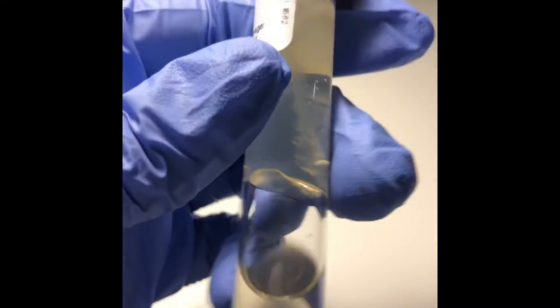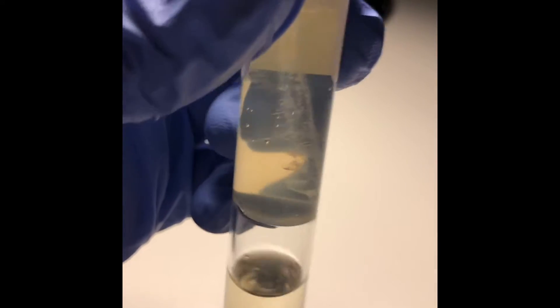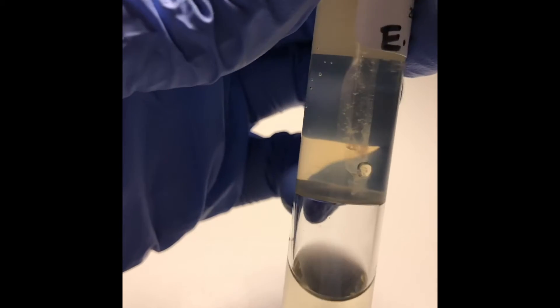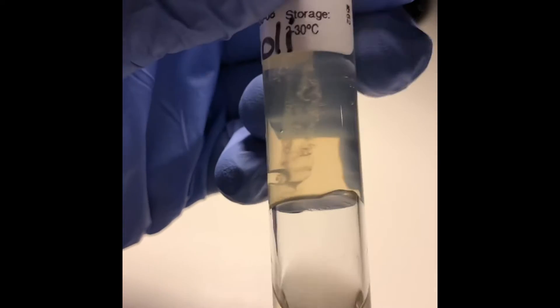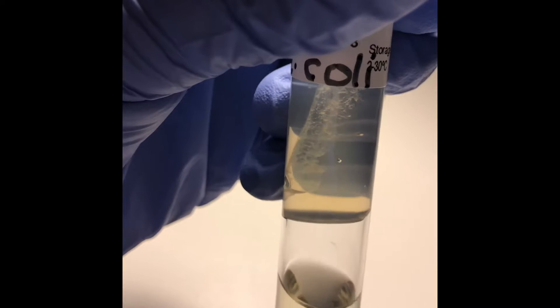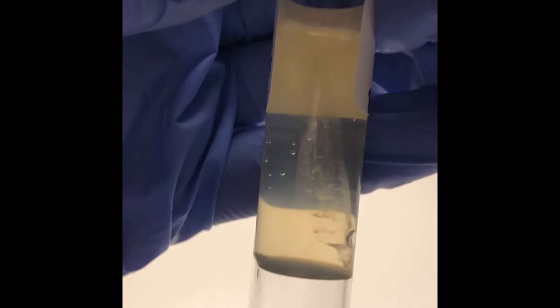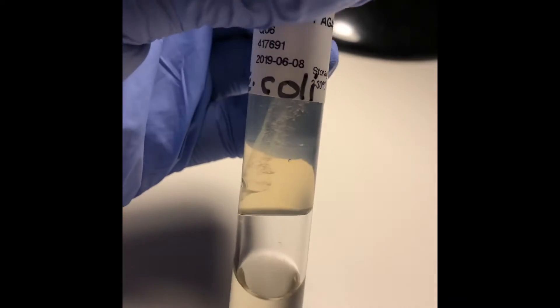It's been 72 hours since I let these two motility tests incubate, so now I'm going to talk about the test results for both. Starting first with the E. coli test agar — this tube only required 48 hours of incubation and there's definitely a lot of growth. You can see where I stabbed the agar, but the microbes have exceeded the stab line and are growing in other places in the tube. There's actually one spot right below the 'L' and 'I' of the word 'coli' that I wrote where you can see growth. You'll also see hair-like structures growing out of the stab line, so this is definitely a motile microbe.